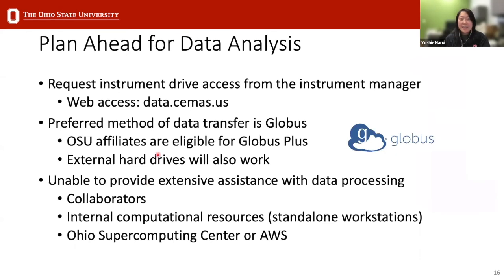Okay, and not the last thing, but in terms of data analysis. Let's say you've gone through this whole process. You have a beautiful grid, you decide you want to collect data, and the data will be collected relatively quickly over the course of a few days, let's say. Then you'll be left with lots and lots of images of your single particles, or it could be tomography data as well. And if you're doing screening, you might just take individual snapshots of your grids.